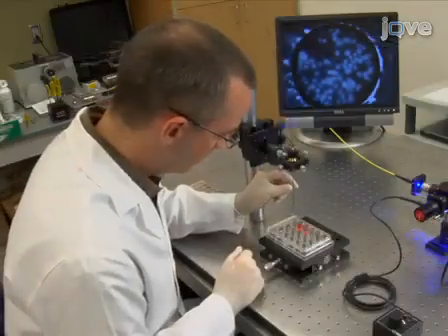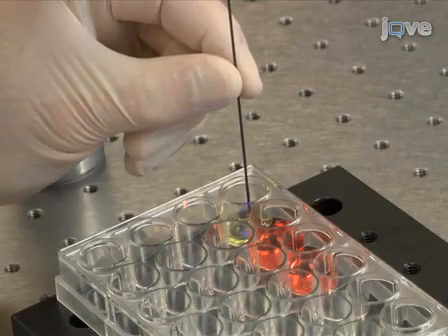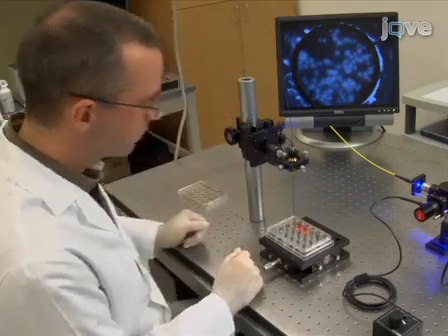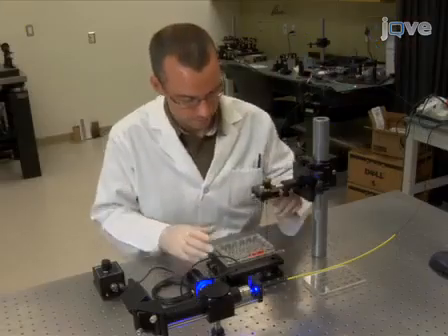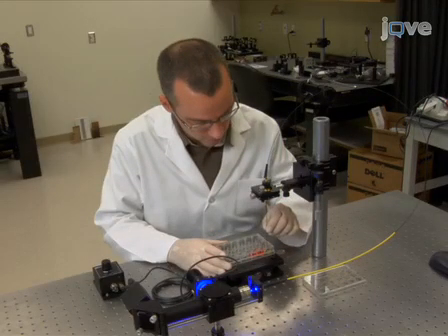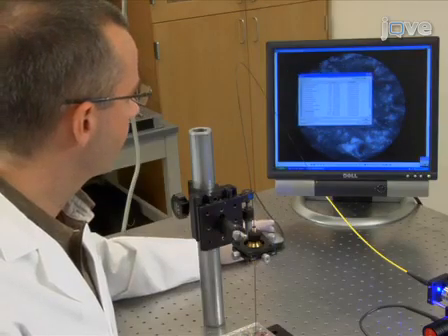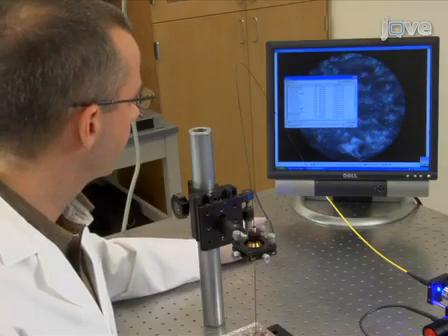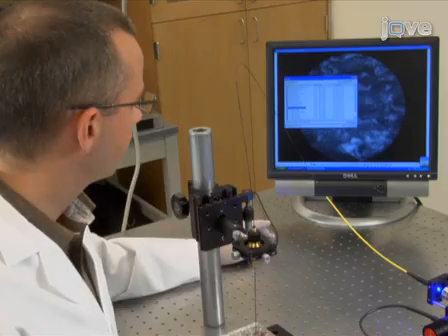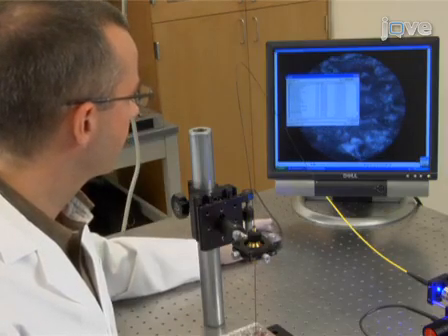Mount the distal end of the fiber bundle in a secure fixture with manual positioning stages on XYZ axes for stability during imaging. Following application of the dye to cells or tissue, place the fiber optic bundle in light contact with the sample. View the image of the fiber optic bundle on the computer screen, either using the software supplied by the camera manufacturer or any custom software which you may wish to develop. Adjust the exposure time and gain settings of the camera to obtain an image that is of acceptable brightness.